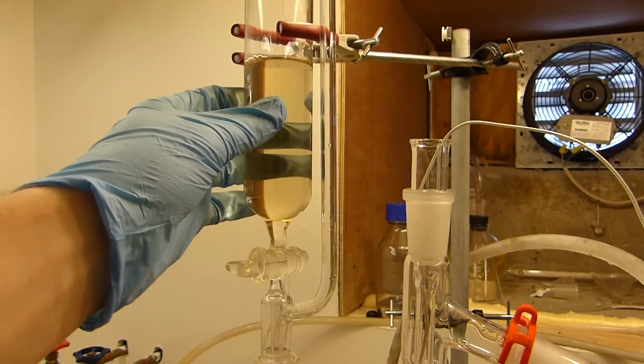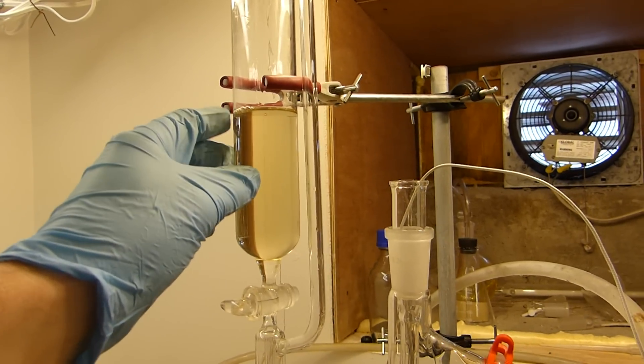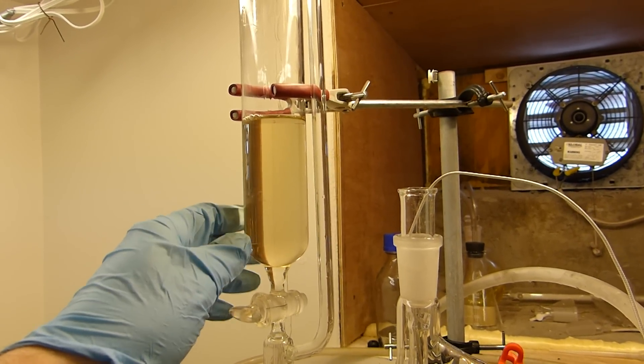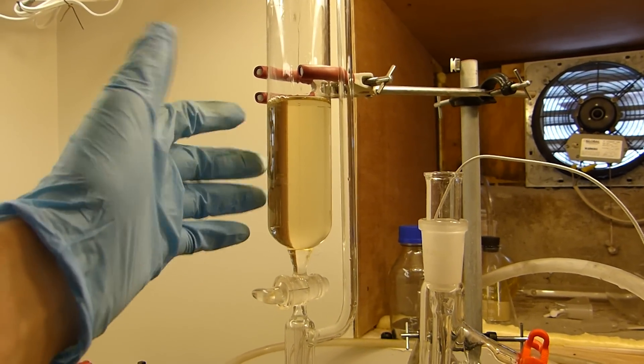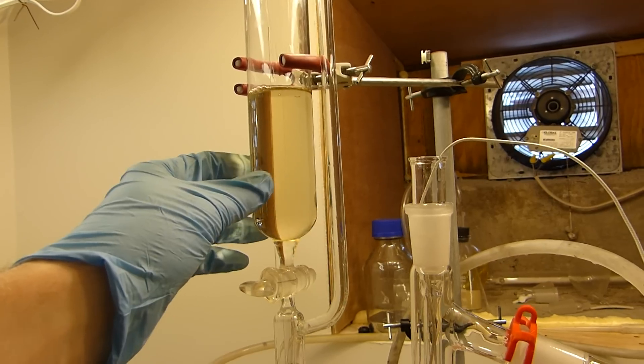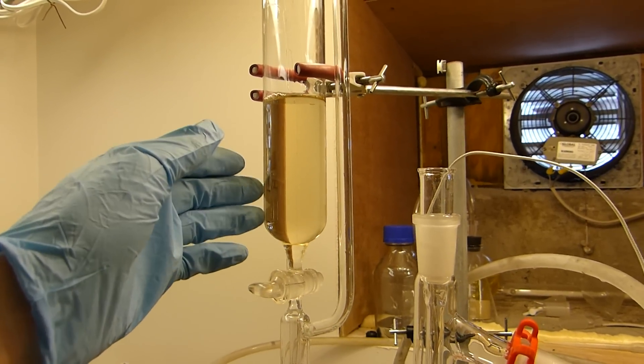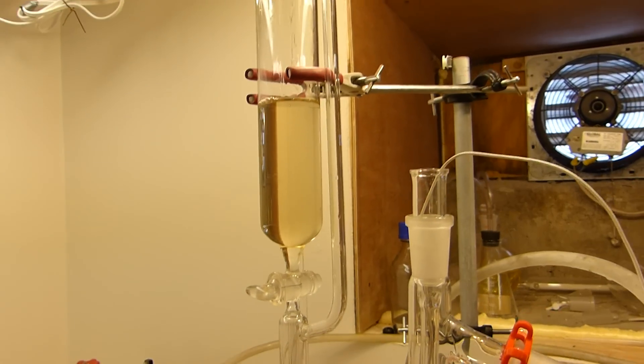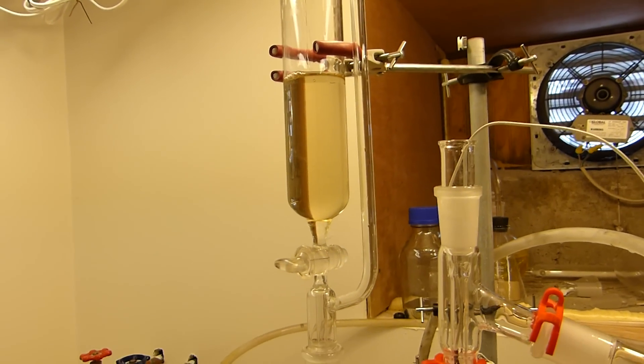This is 264 grams of sulfuric acid, and that's compensated for both a 1.25 times excess with respect to sodium acetate, which helps further dry the acetic acid, as well as it's been compensated for its concentration, which is I believe somewhere between 93 and 95 percent by last titration.